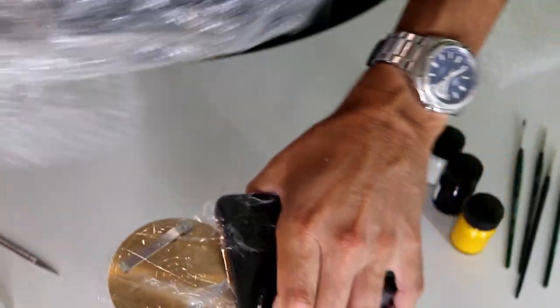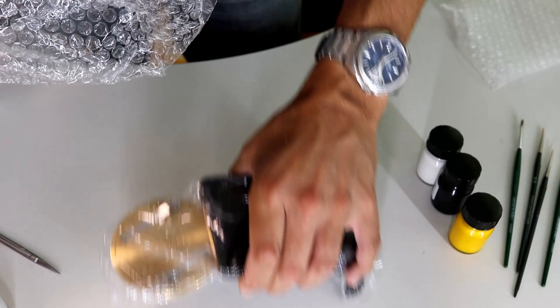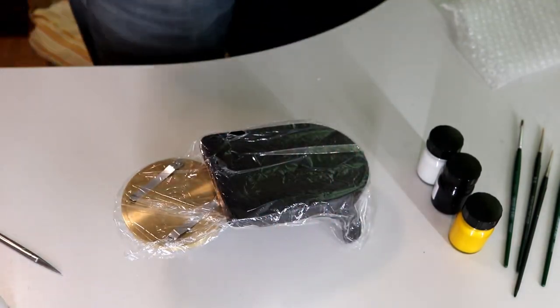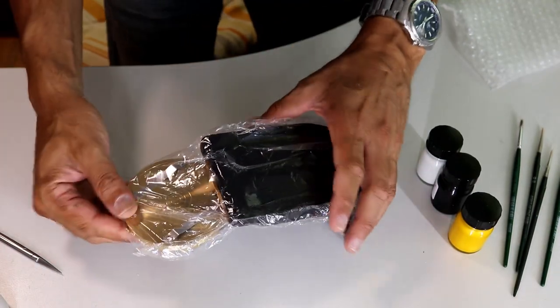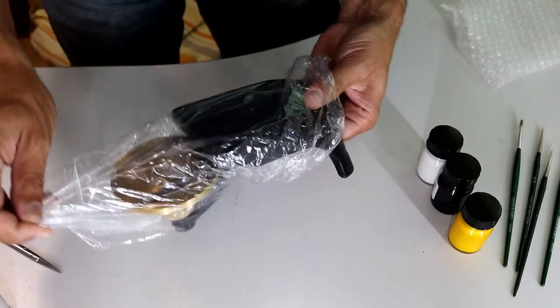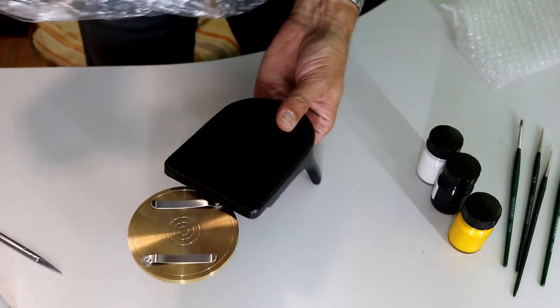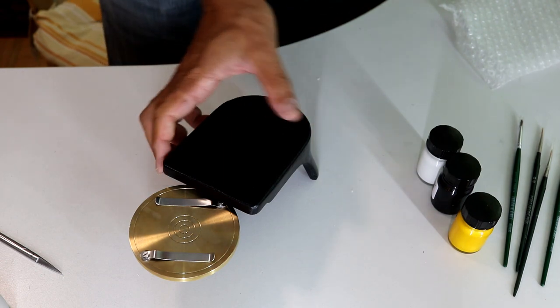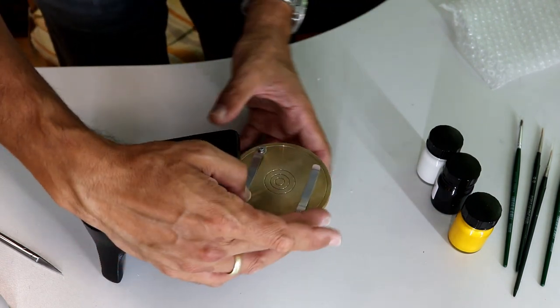Now here, this is the main part, this slide ringing table. It's actually smaller than I expected, which is quite good because I was already worried it's getting too big for storage purposes. So it's quite compact and, as I already mentioned, made of solid metal and relatively heavy for stability reasons.